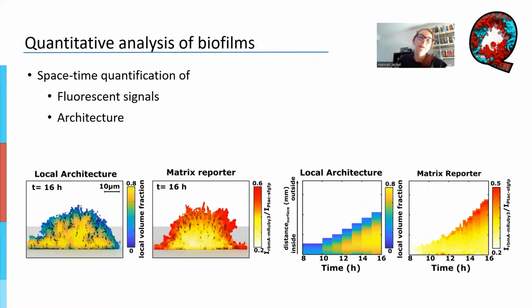After you have segmented the cells, we want to calculate properties. And these properties can be quite diverse. One thing that people often want to measure are fluorescent signals, and where and when they switch on during the experiment. This when and where is summarized in these heat maps that you see here on the right. This is called a kymograph.